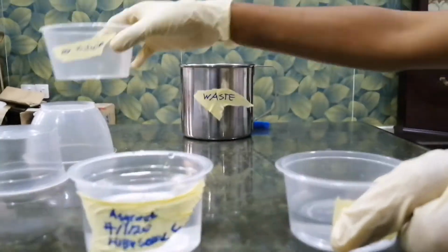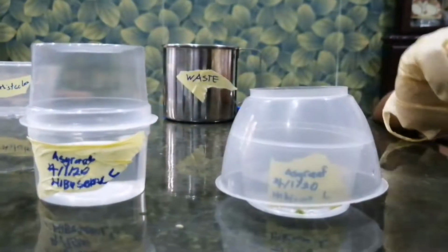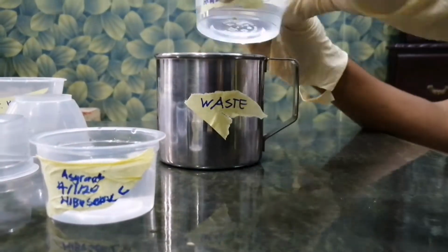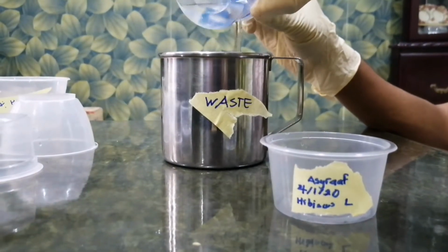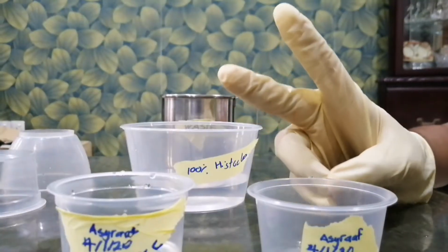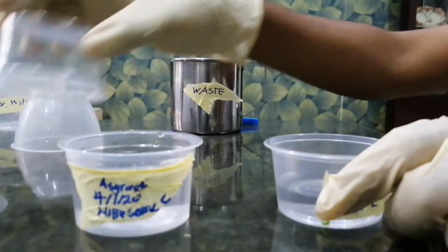For the final step of the clearing process, the sample will be immersed in 100% volume over volume Histoclear at room temperature. The sample will be immersed for 15 minutes. This step will be repeated 3 times.